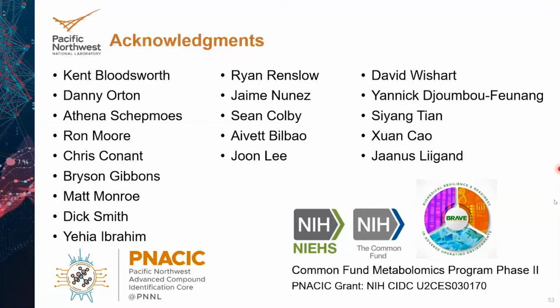And so running an extended gradient, doing offline fractionation, looking at effects of freeze-thaw and so forth, I would argue that we can't fully address the impacts of those right now, simply because we just don't have a good, struggling with the right words, a good representation of the data in terms of the total chemical complexity based on confident identifications. We're just not there yet.